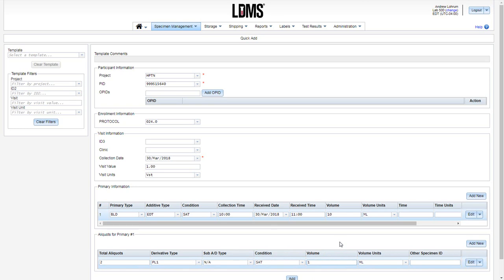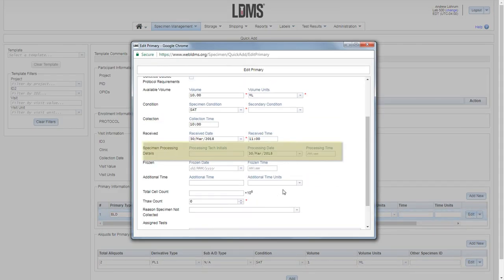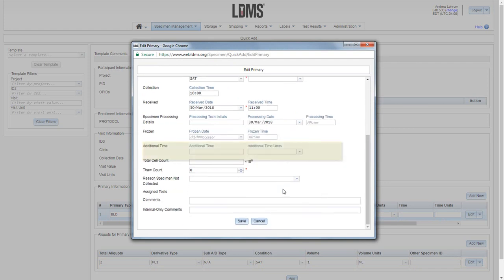If you have processing information available at this time, click the Edit button next to the primary specimen. You can enter in any of the processing information and click Save.